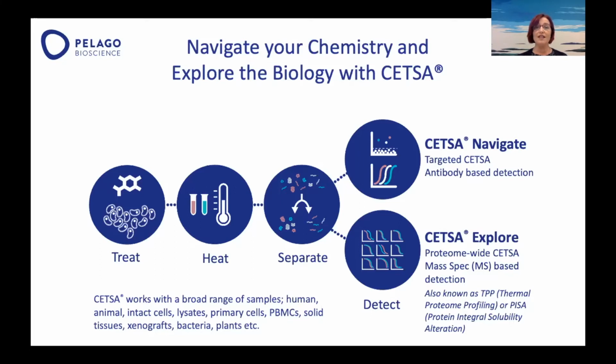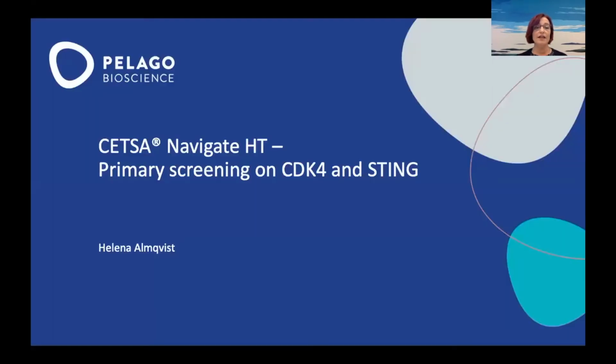And now I will hand over the floor to my colleague Helena, who will talk about CETSA Navigate HT, and how it has been applied to primary screening on CDK4 and STING. So thank you very much, Ylva, for that.